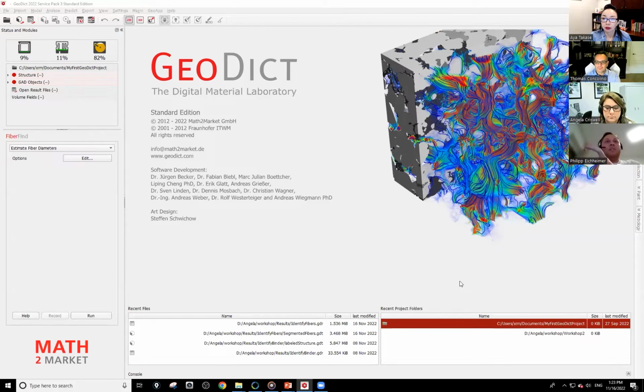We can create a digital twin using our FiberGeo module. We can input all the fiber diameter distributions, the lengths of the fibers, the sizes of the fibers, and then create a so-called statistical digital twin, which has exactly the same statistics as the micro-CT. And then we can start doing simulations and optimize the filter media, figure out which parameters have the largest effect on pressure drop, filtration efficiencies, and so on.